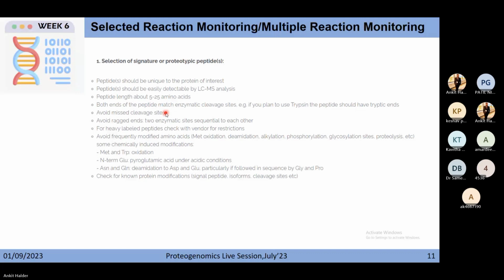Generally in global proteomics datasets, whenever you do primary data analysis, the proteomics community standard is that up to two missed cleavages are allowed, so that your algorithm can detect the peptides where trypsin has missed up to two sites, and still identify your particular peptide.